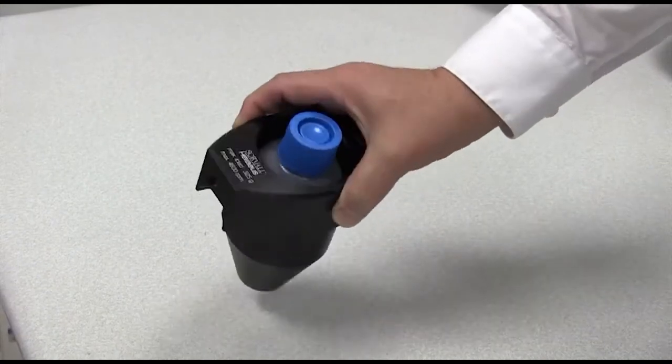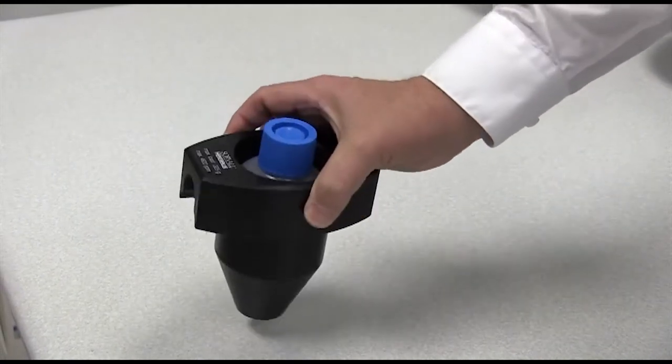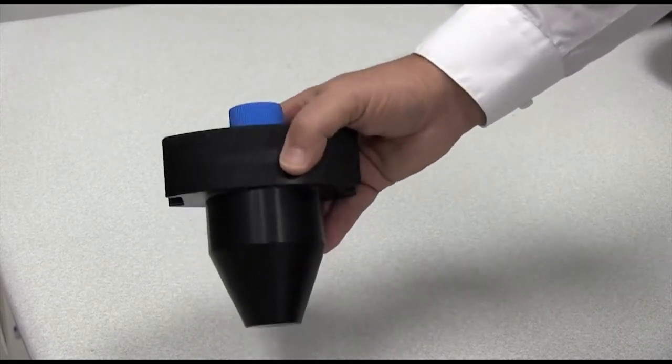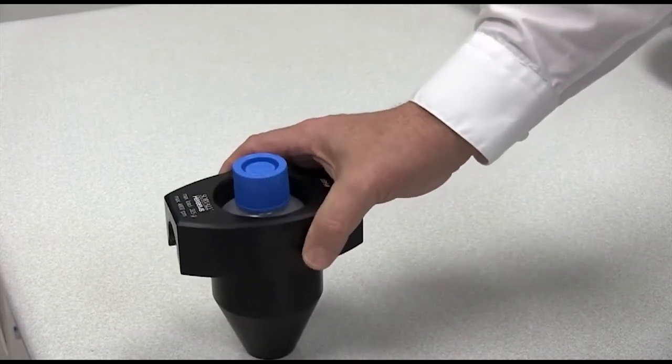Here we have just a bucket off of a swinging bucket rotor. I didn't bring the whole heavy rotor here, but this is one of four buckets that go on the centrifuge.